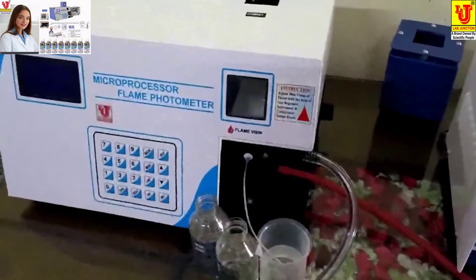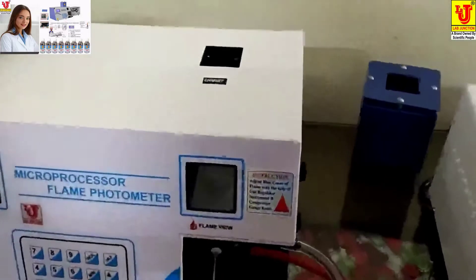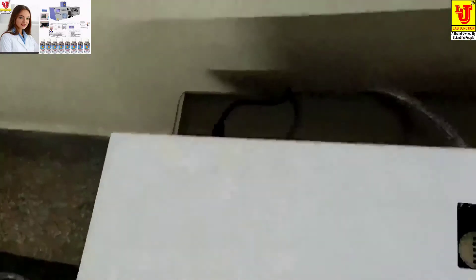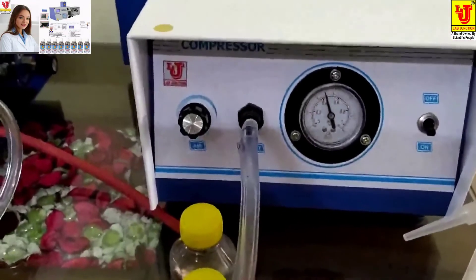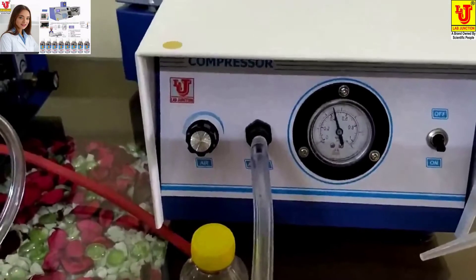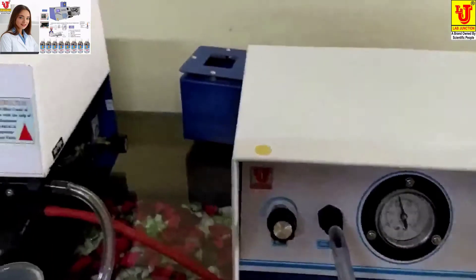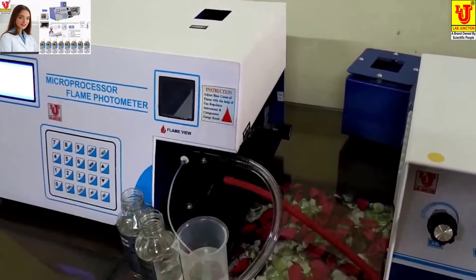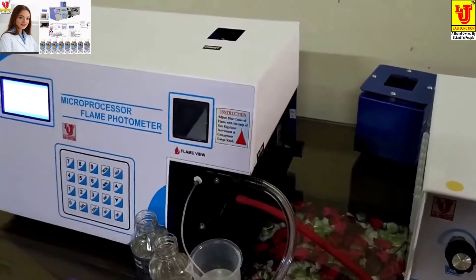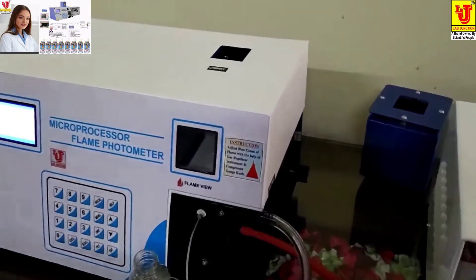Now, the first main thing is how to light the flame of the flame photometer. First of all, you have to switch on the main unit, then switch on the compressor. Sometimes the compressor switch-on takes five to ten minutes due to power supply — in some areas the power supply does not achieve 220V, it may be 210 or 200.